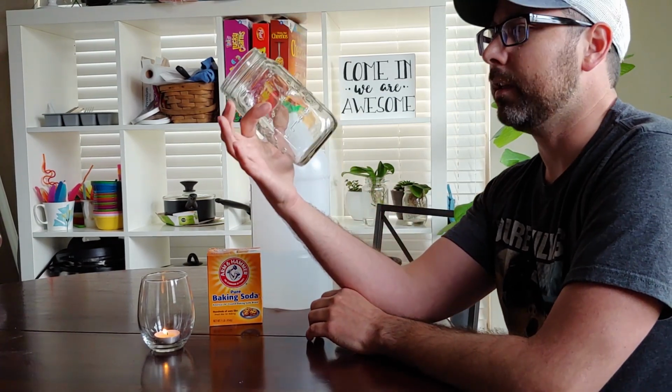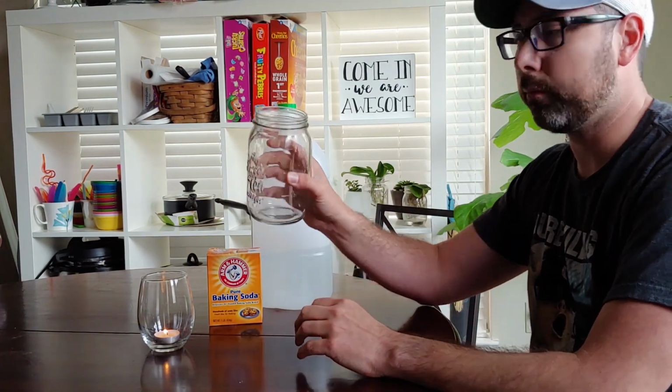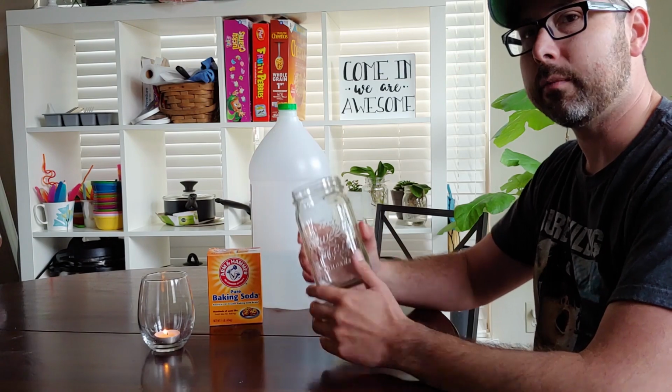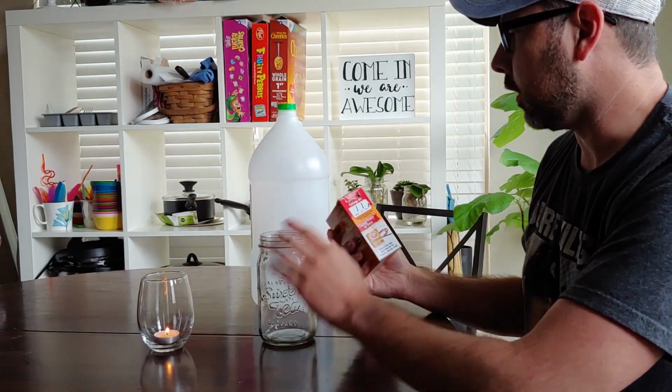Now, you may think, how are you going to pour it out? It's a gas. Well, it's a more dense gas. It's heavier, so it's going to pour out just like a liquid, but it's invisible. But we will see evidence in just a moment. So let's go ahead and get on with the reaction here and get the carbon dioxide we need.